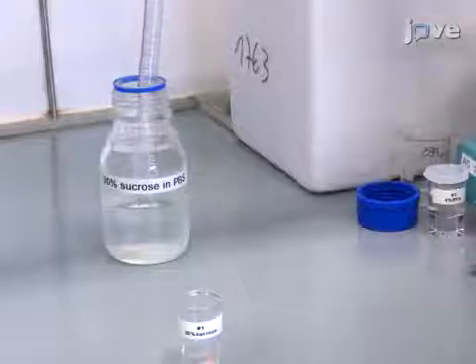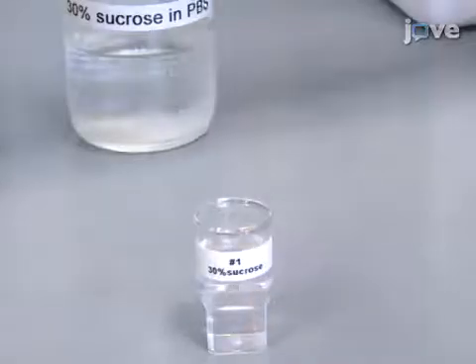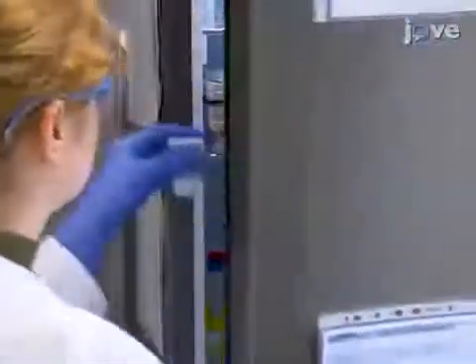The next day, exchange the PFA for 30% sucrose in 0.1 molar PBS and incubate for another two days at 4 degrees Celsius to cryoprotect the sample.